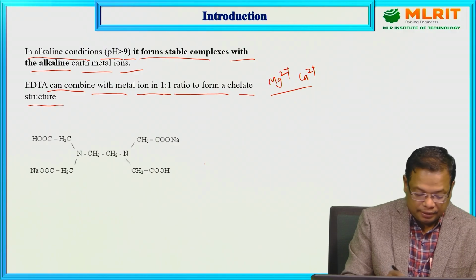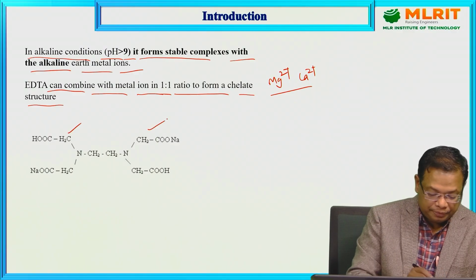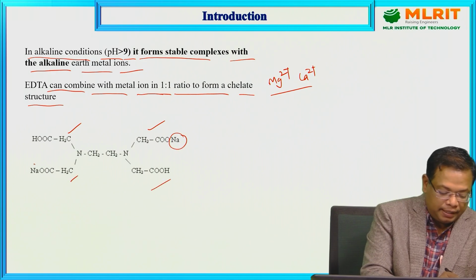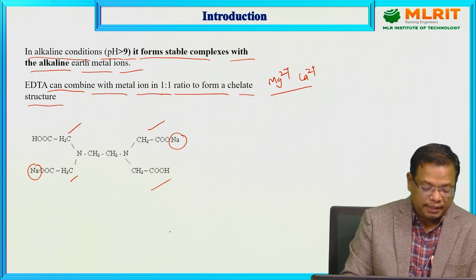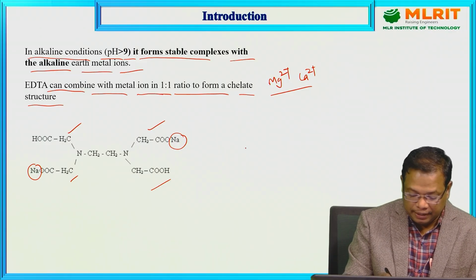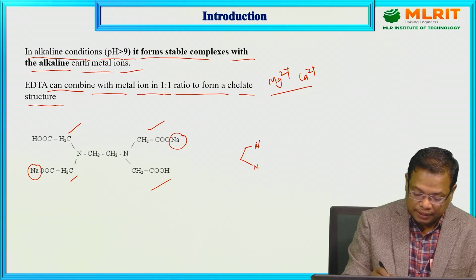Generally, this is the EDTA structure. It is a salt, the disodium salt of EDTA. So, generally, this is the complex. How it forms, we can see here.